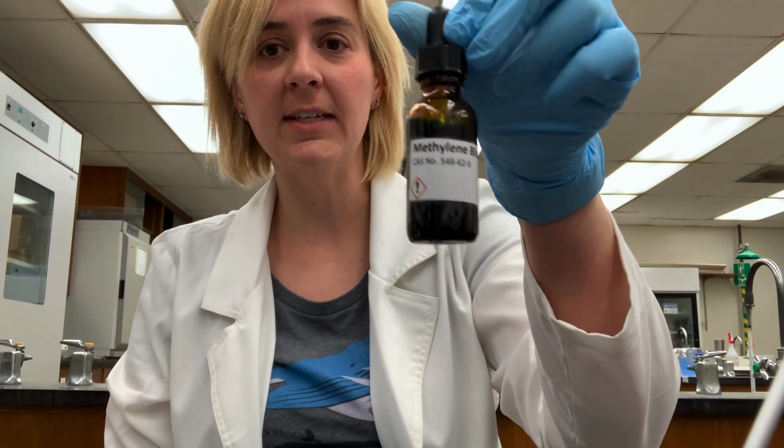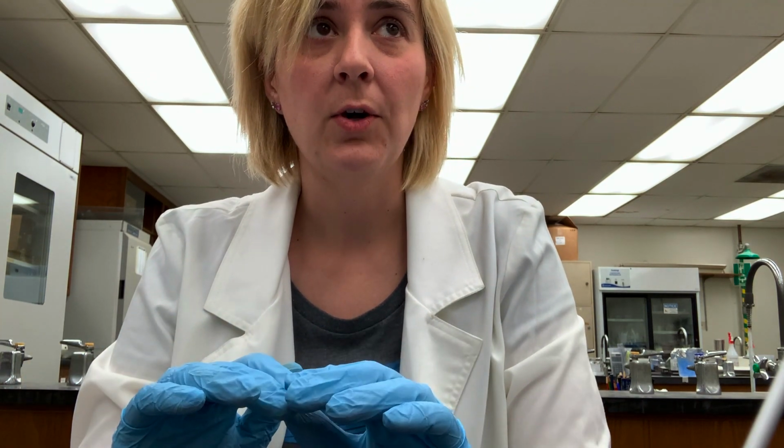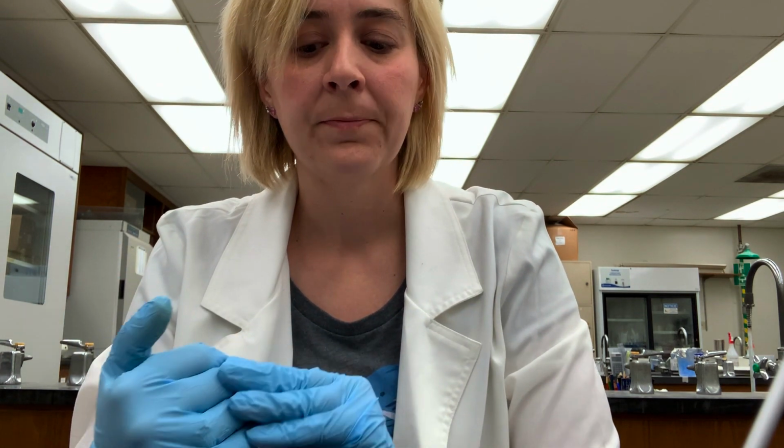And so the stain we're going to use today for this one is methylene blue. It's going to make it blue. So we're getting all the pretty colors, purple, pink, and blue. And so what the methylene blue will do, it is also a basic stain. So I want you to think about, what does a basic stain do? Is it going to stain the cell? Is it going to stain the background? So these are things that you have to think about.